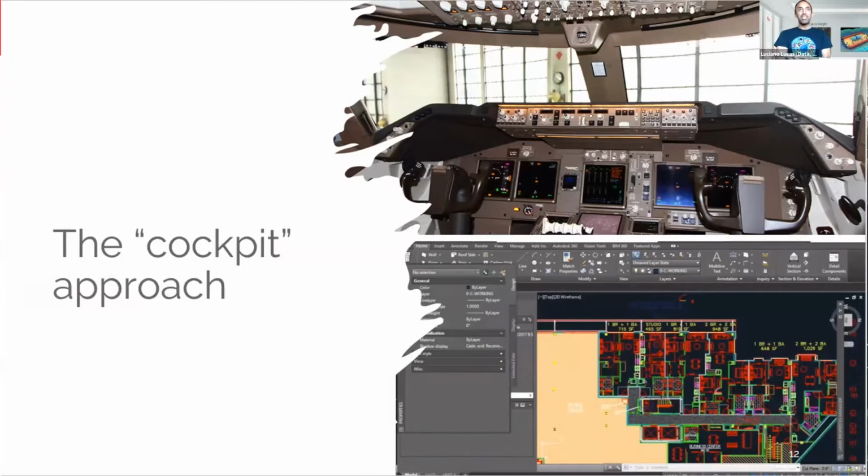So what I was saying is all the softwares actually are pretty complex. They have this cockpit approach, and users need to learn it, need to master it, and then click lots of buttons in order to get to some sort of result. Even if it's a pre-trained deep learning model, like what you saw a moment ago, and what we have also, you still have some parameters that you have to set up. You still have to do some training potentially, or at least learn how to use the software so you can apply it.